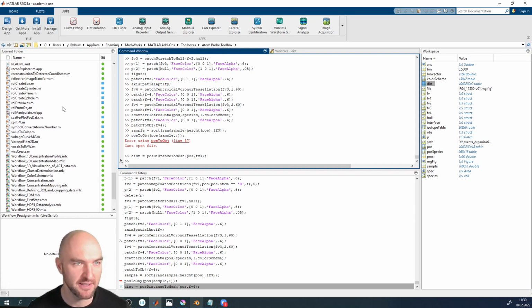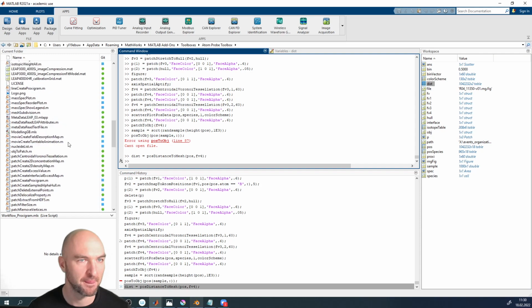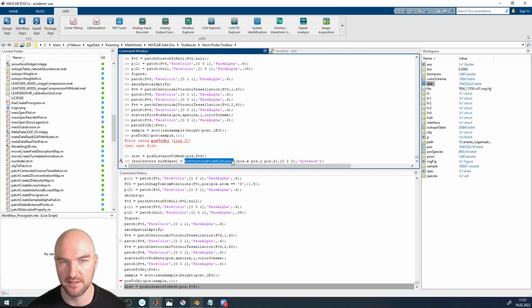And we have a function for that, which is called bin vectors from distance. So you get your bin vectors because you might have more than one bin dimension. In this case, we only have one bin dimension, and this dimension is dist, or distance.